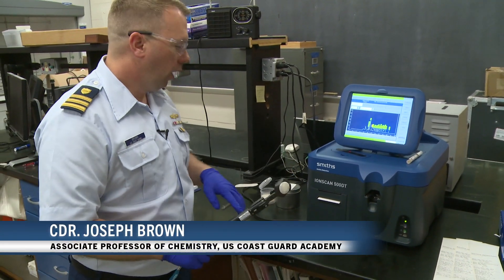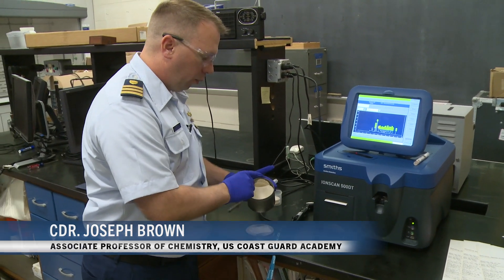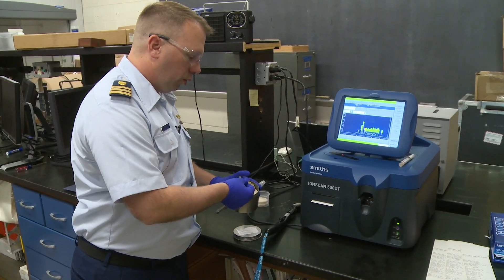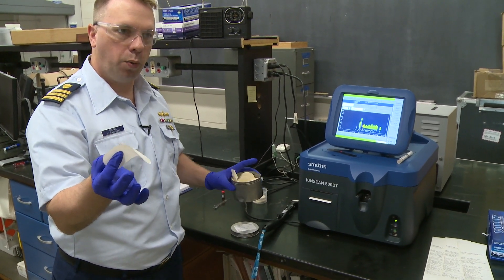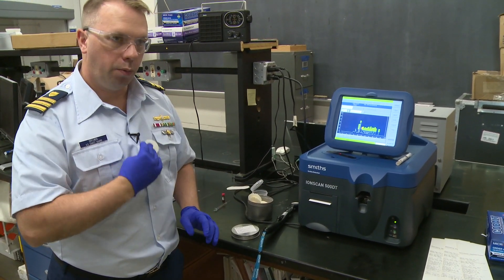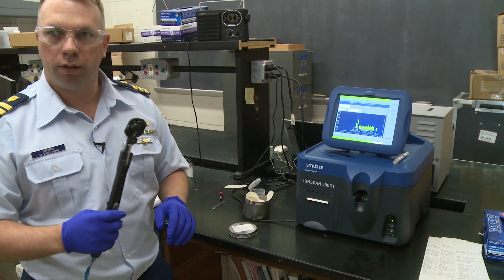You've probably seen these wands before. For Coast Guard boarding teams, generally it's more of a swab that we'll use, and you just use finger pressure to do it. It's just an oblong swab and you would just run it down with finger pressure. We'll use this because it's a little easier to demonstrate.